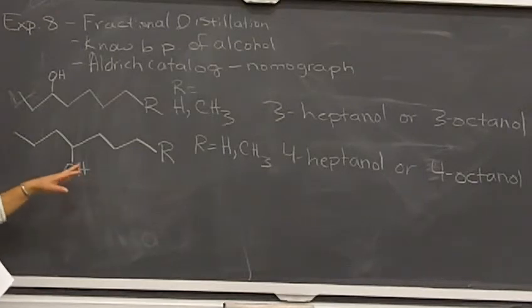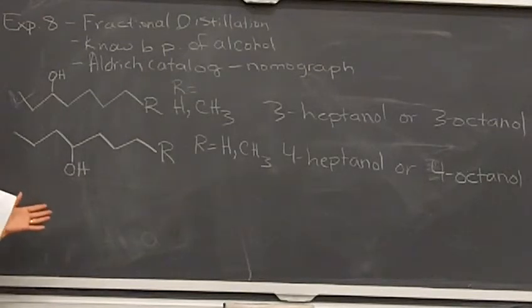So just make sure that you don't need to take 5, 10 fractions from this distillation. You only need the fractions that contain your alcohol product, okay? So you don't need everything that comes off before that alcohol product. So just start collecting alcohol 10 to 20 degrees below the boiling point of your alcohol.